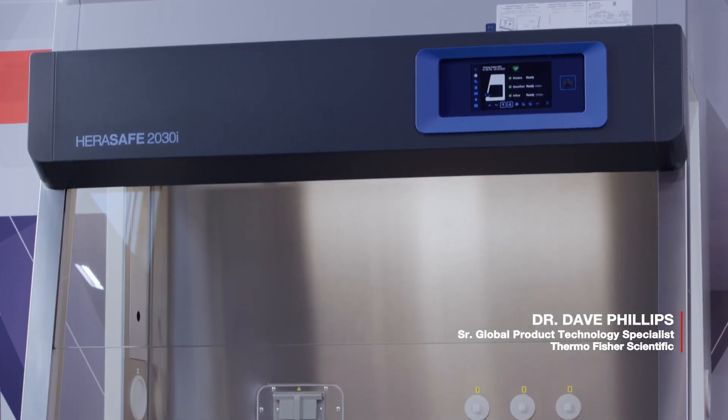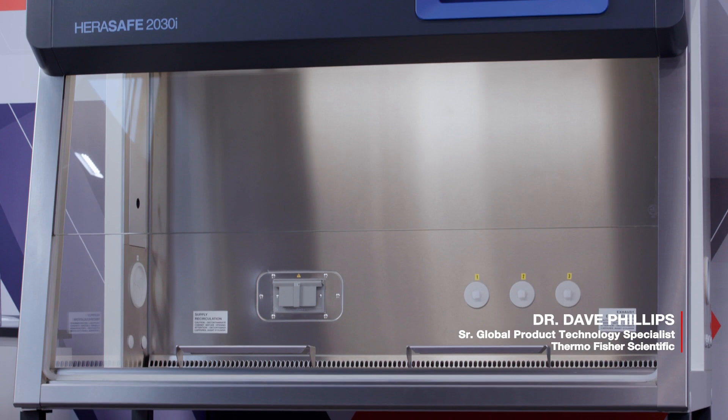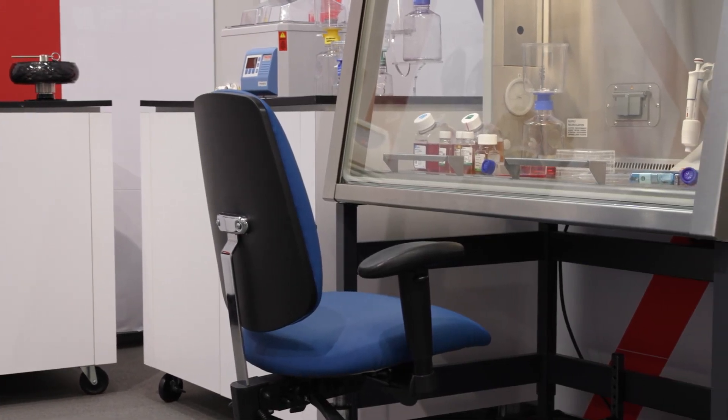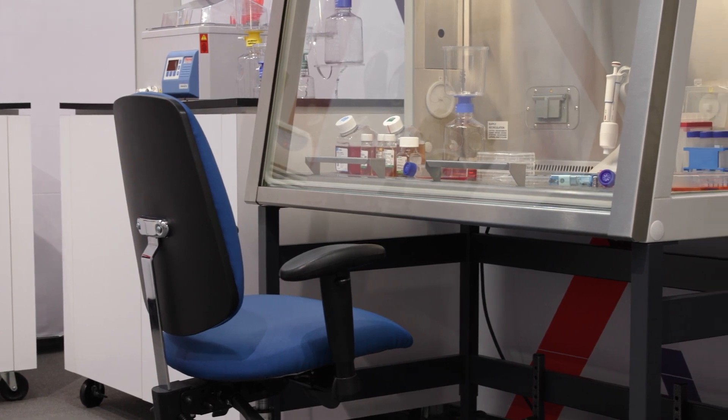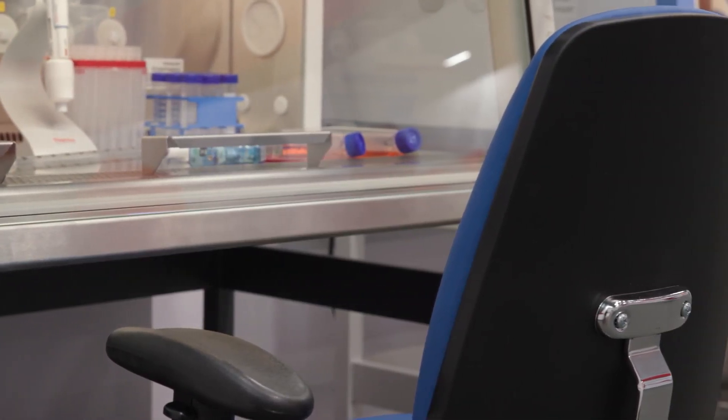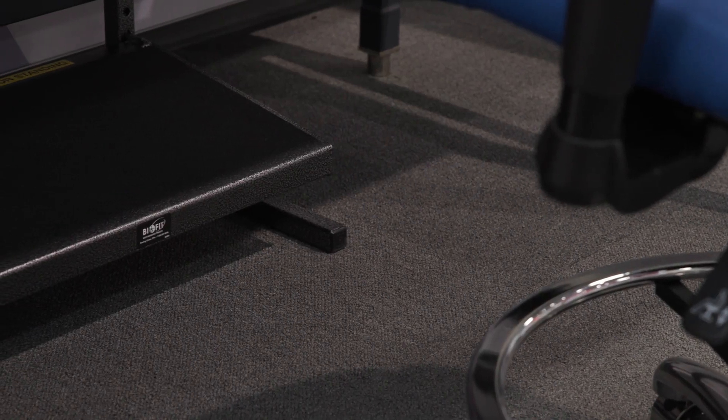Biological safety cabinets are laboratory workstations that provide cleanliness and containment for work with biological agents and hazards. In this video, we will examine factors to be considered by new owners of a biological safety cabinet in setting the heights of the cabinet work surface, chair, and footrest.